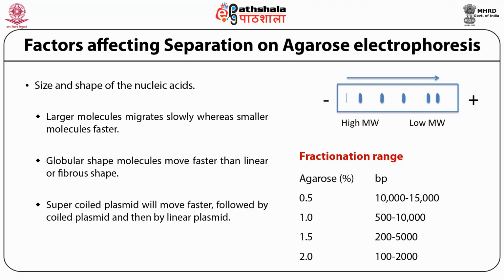1 kilo base pair or 1 kb is equivalent to 6,20,000 Daltons. Commonly used plasmid, that is pBR322, is of 24 lakhs Dalton, and the size of it is referred to as 4.32 kilobase. Pore size or the sieving effect of agarose depends upon concentration of agarose.